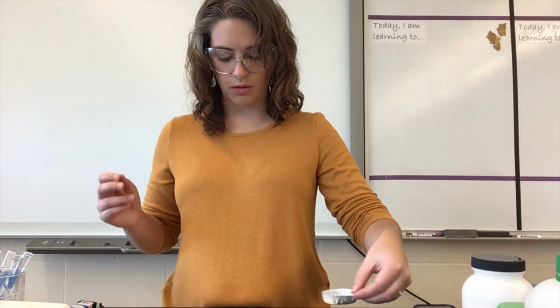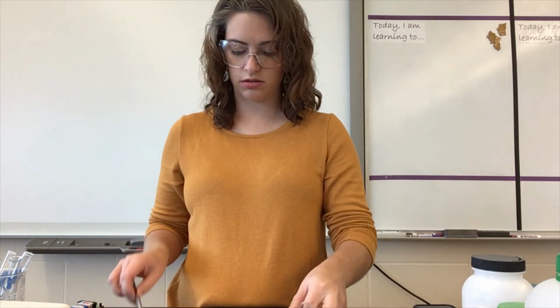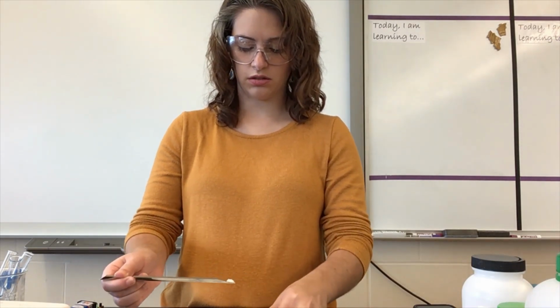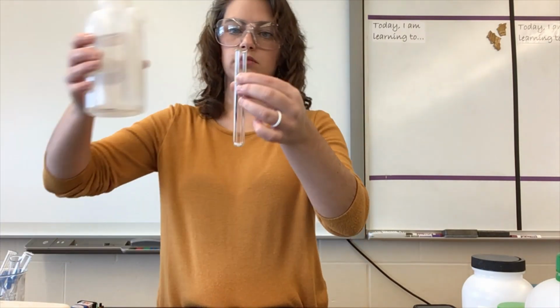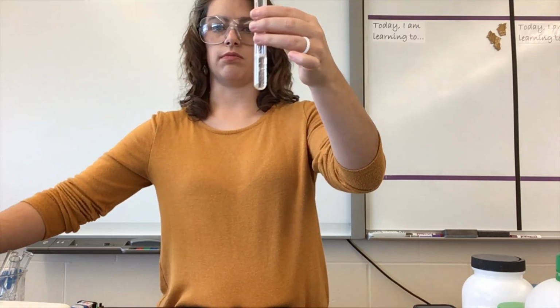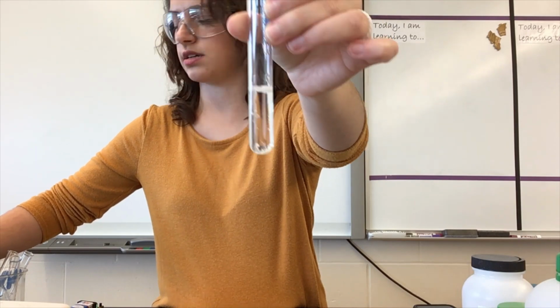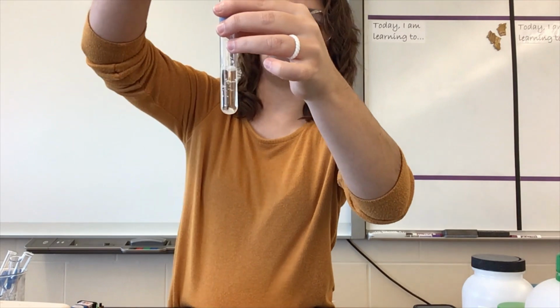Okay, first up, solubility. Test tube, small amount. Add some water. Okay, this one's a little bit different. So if you notice, it actually floats on the top. So I'm gonna give it a stir, but it does not look like it's dissolving.